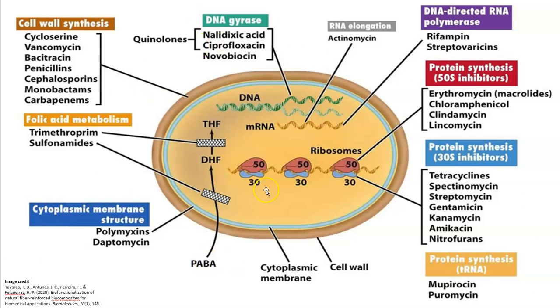This image is just a really good depiction of all the different ways that antibiotics work. You'll be learning about antibiotics and their mode of action in lecture, but this does a brief summary. For example, we don't get to do all these antibiotics, but I tried to pick one antibiotic from each class so you do get some exposure.